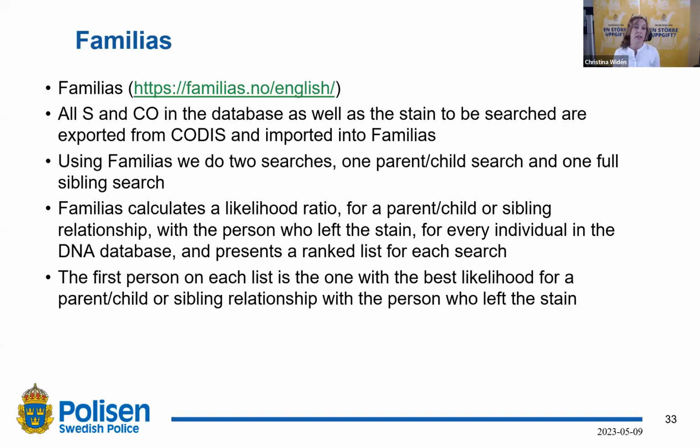And then it may be good practice to do additional analysis of the persons on this list. But in Sweden, we're not allowed to save any reference samples. We have to destroy them within 6 months. And in practice, we do destroy all reference samples after analysis. So we cannot do any additional Y chromosomal analysis, for example. So the police will have a rank list of what we have and what we get from our database.